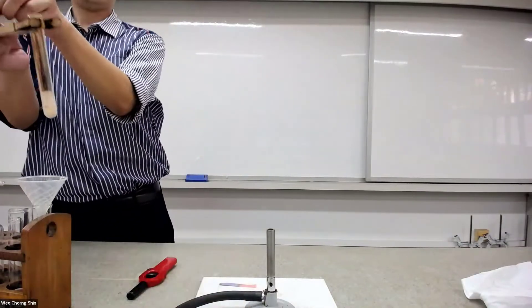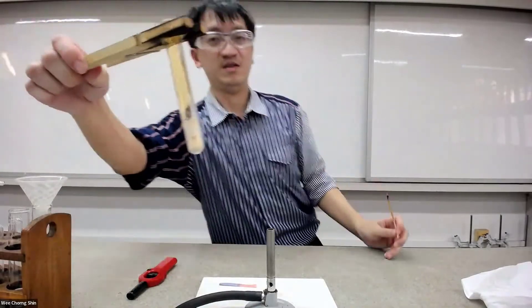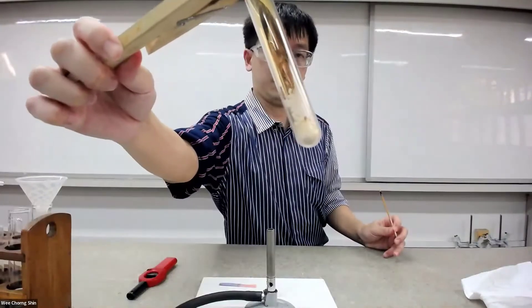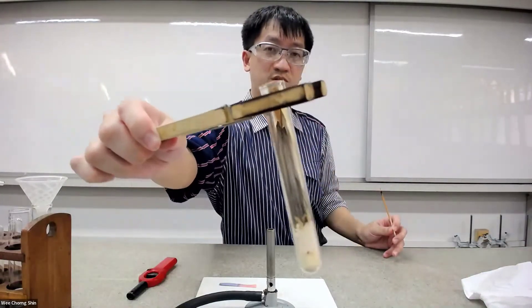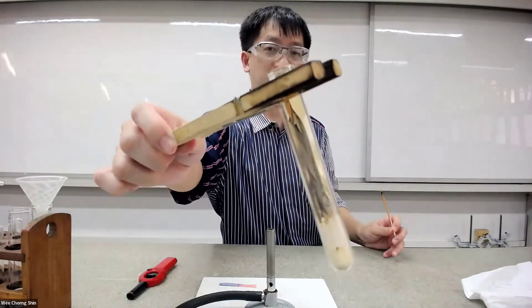So that's it. This is the final appearance. We can still see the dense NO2 lingering around the stem of the test tube.